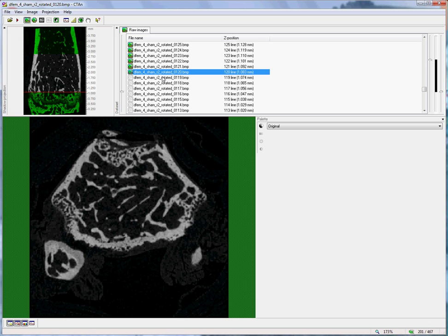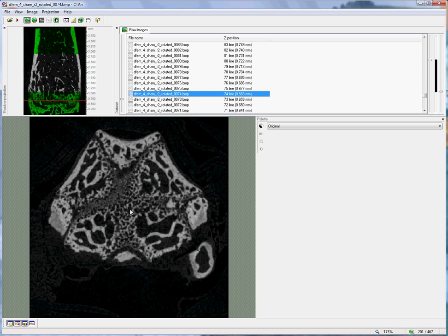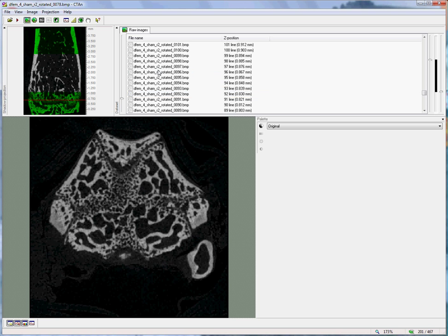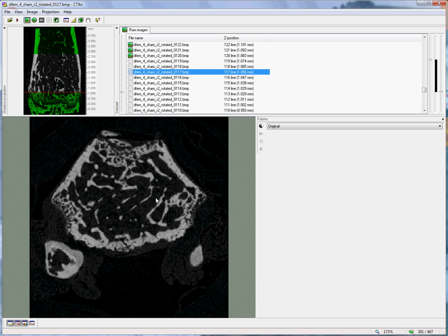So the 50 slices represents what we call the offset because we don't want to actually analyze the bone close to the growth plate because it contains this primary spongiosa. Instead, we wish to analyze the mature structures of secondary spongiosa such as these.